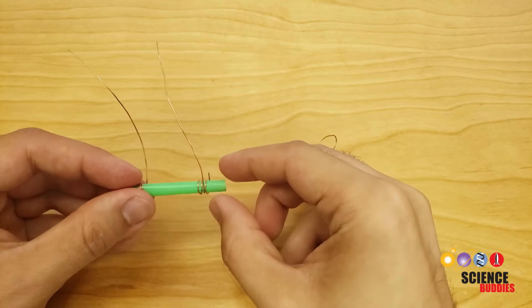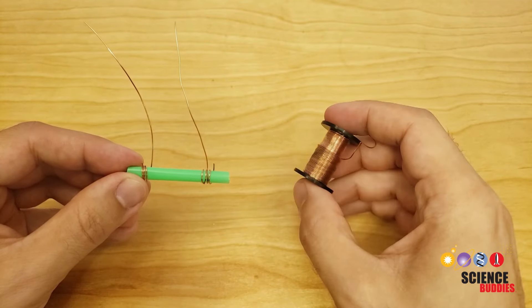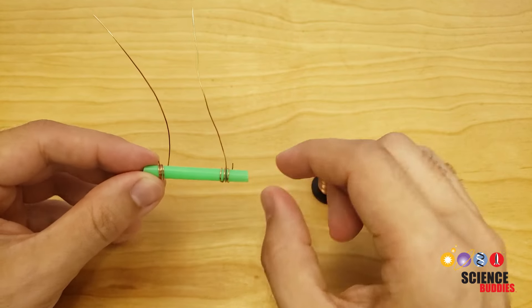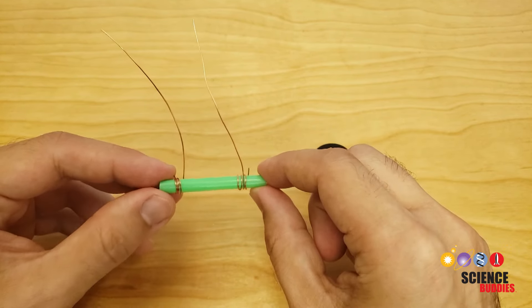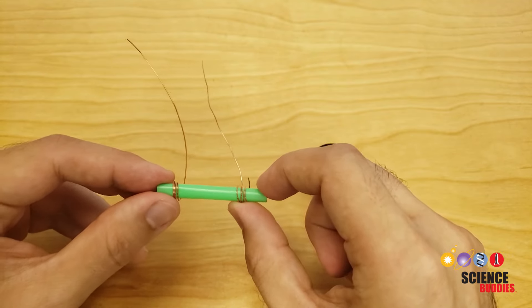To start the project, you will need to make your conductance sensor. Your electrolyte challenge kit comes with a small spool of uninsulated copper wire. To make the sensor, you cut a short piece of straw, cut two pieces of the wire, and then wrap each piece around each end of the straw.